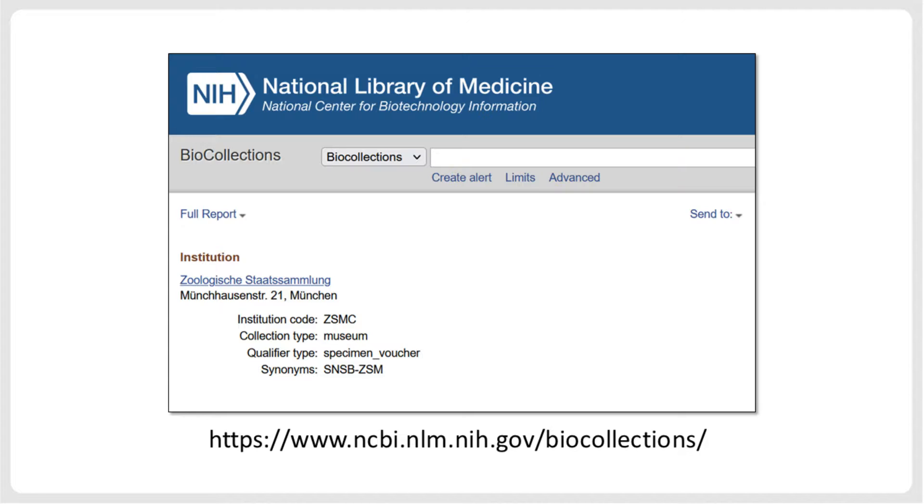To specify the specimen voucher, NCBI has a separate database with approved collection acronyms. If your samples come from one of the collections listed there, make sure to use the acronym as specified. If your specimen comes from a collection not listed there, GenBank will also accept other collection acronyms.